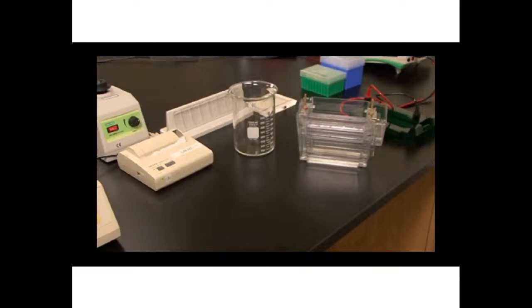After I open the gel cassette, I use forceps to remove the IPG strip from the surface of the gel. Starting at the bottom of the gel, gently pull the gel away from the surface of the cassette. The easiest way to do this is to turn the gel upside down over the surface of the staining solution and remove a corner until the gel falls into the solution.